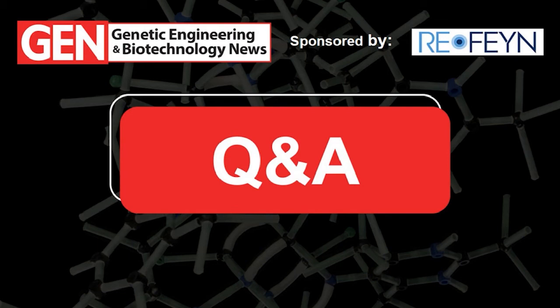Thank you for the question. The mass range is from 500 kilodalton to 6 megadalton. Likely we can go a little higher than that. We have to be very honest with you, we have not determined the exact upper range because we are lacking a sample that is that big that we can measure, but it certainly can measure between 500 kilodalton and 6 megadalton.